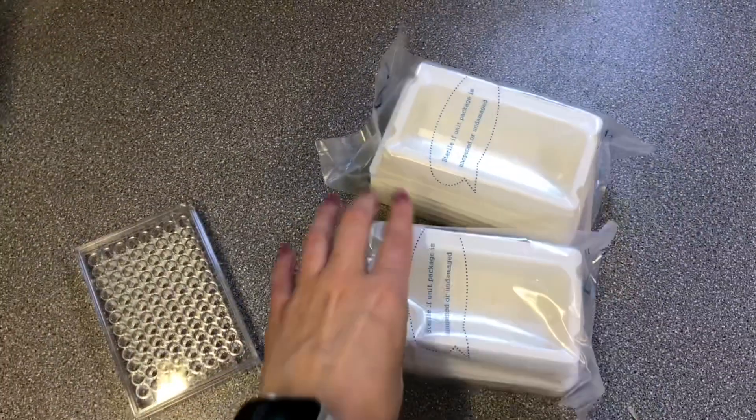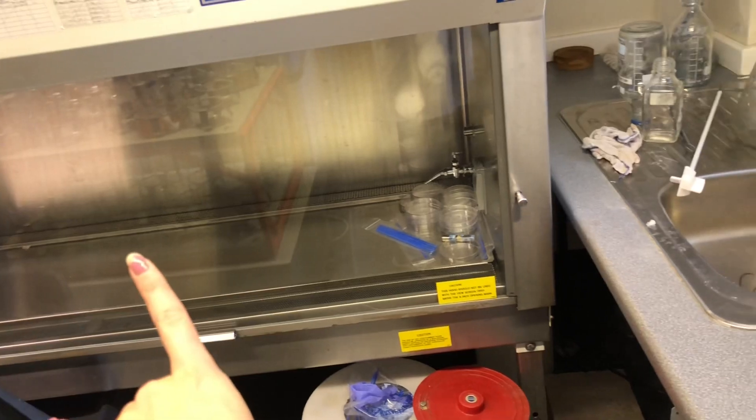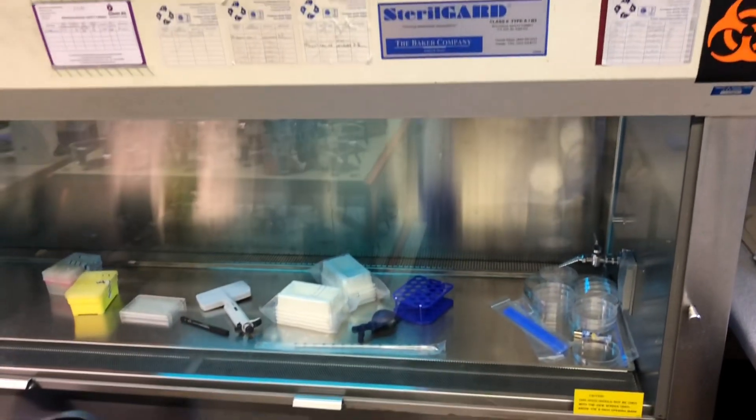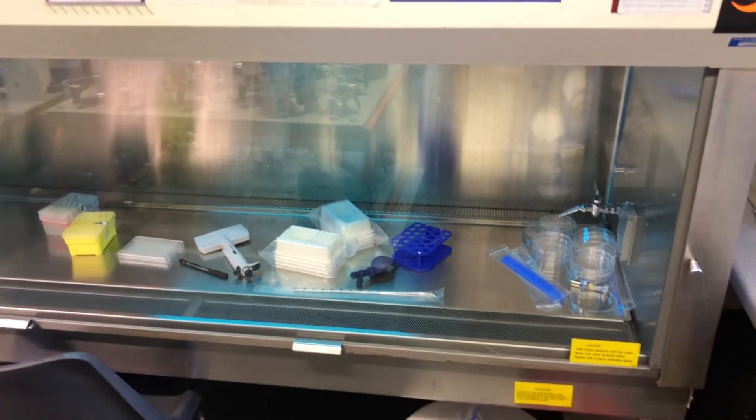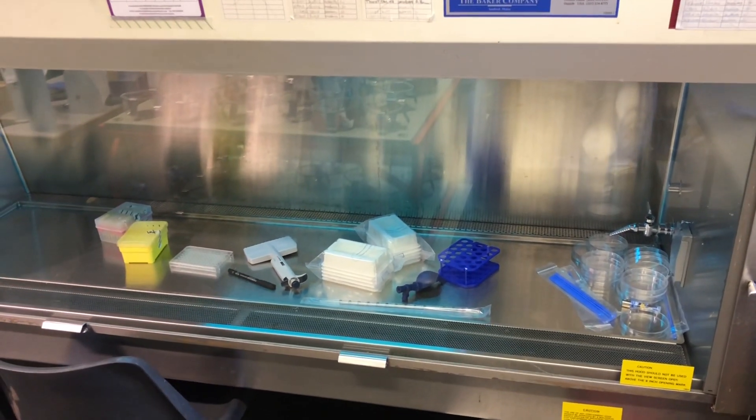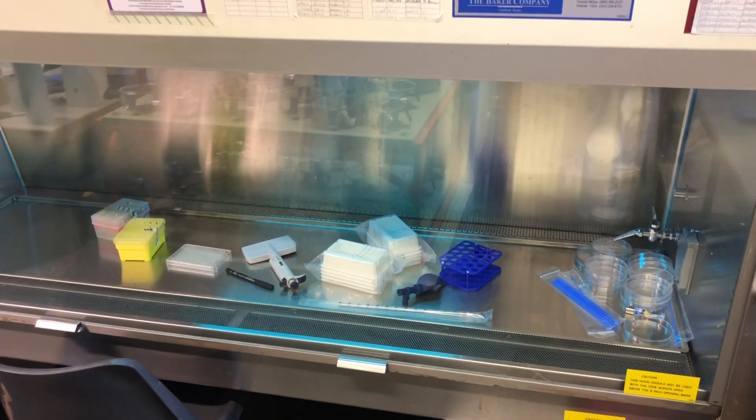I'm going to put my things to sterilize under the UV. The UV light is on and all my things are getting sterilized. I forgot some tubes to go in this rack so I'm going to go get them — just wait half an hour and then I can make up my plate. I'm really hoping I'm not on solvent duty today because I have to leave for a mini field trip at about half past 10.